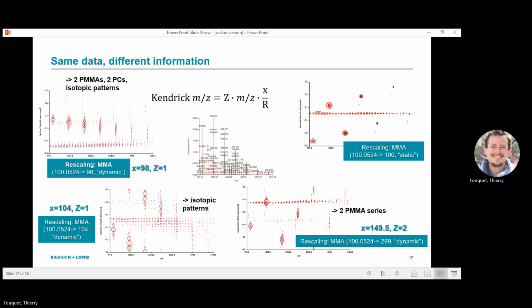Or I'm using here 98, which has the multiple advantage that it's aligning, let's say, horizontally PMMA and also the PC, kind of. So you don't have this oblique and kind of cut or folded alignments. Now everything fits within this fractional y-axis range. There is no more aliasing. Everything is more or less flat.